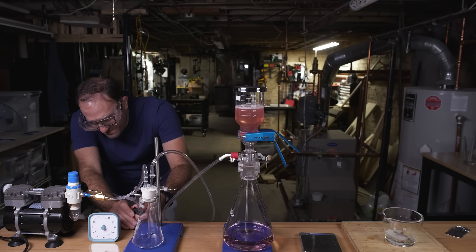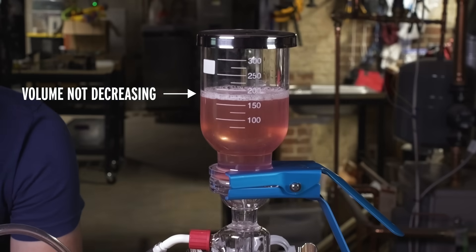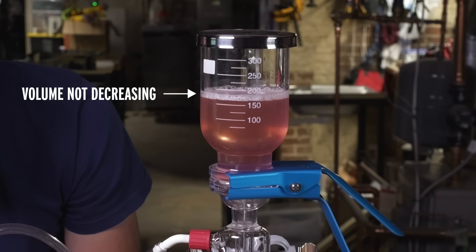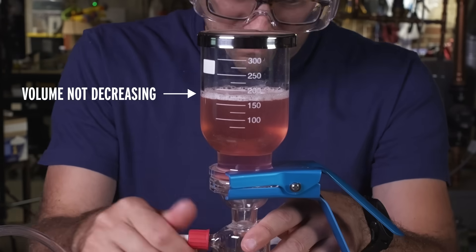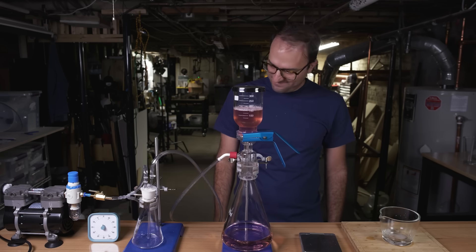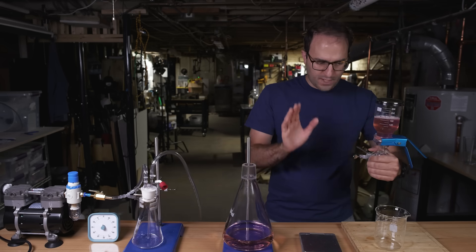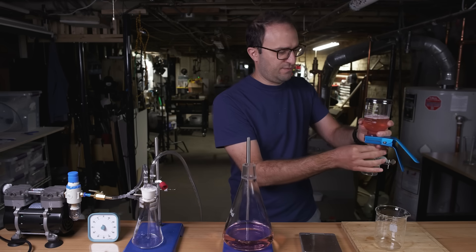Simple plan that did not work. Because it turns out that if you try to run any amount of spit through a half micron filter, even if it's diluted with water, within 10 seconds you will clog the filter. And you will end up, as I did, with like 200 milliliters of Double Bubble infused spit.